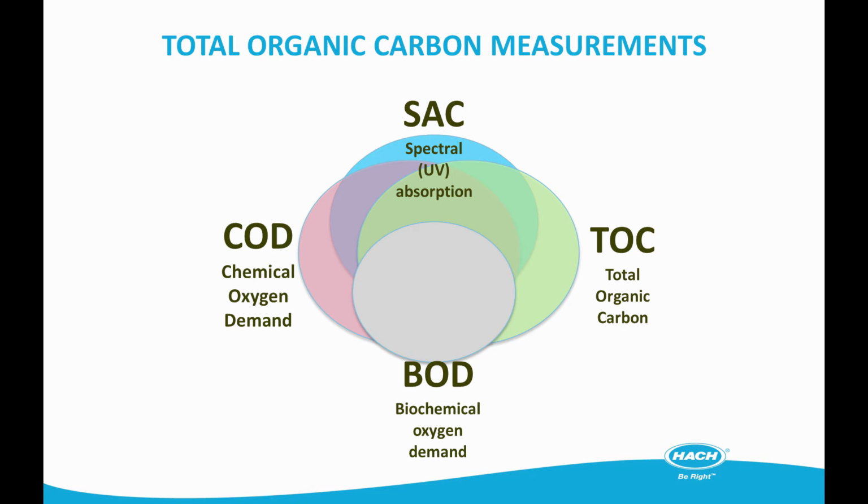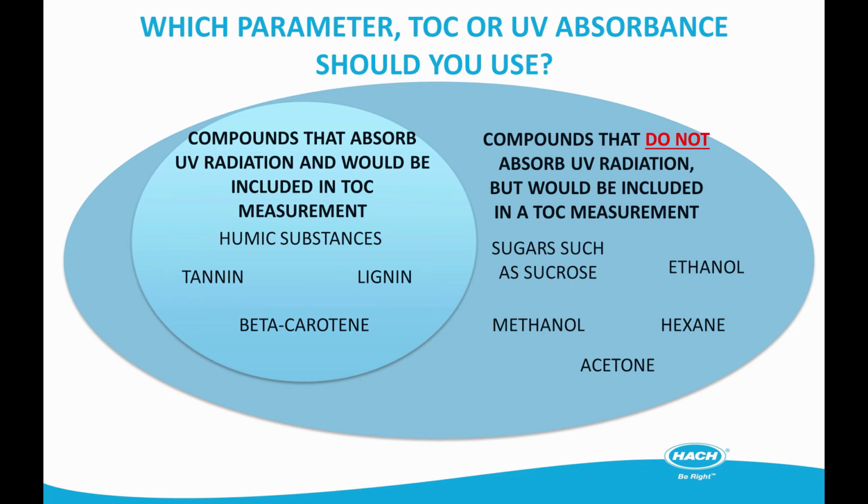Several methods exist for measuring TOC. However, each of the methods have these two common objectives. First, oxidize organic carbon to carbon dioxide, and second, measure the carbon dioxide generated. Knowing which parameter to use can vary depending on application, source water type, and regulations.